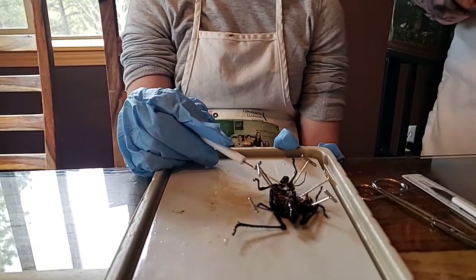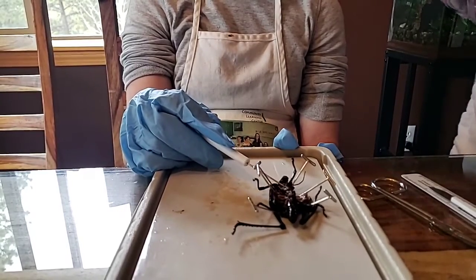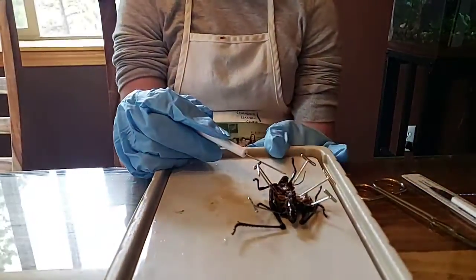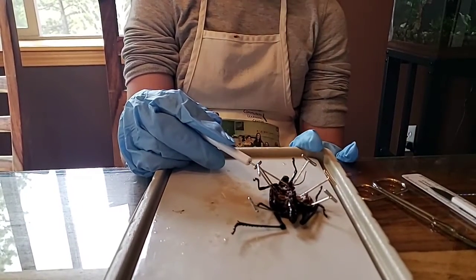That big round thing that you're looking at, see that bulbous thing, Tanley? The big round ball? Yep, that right there. So on your sheets, Lanston, can you open up your sheet so that you can label some of these things for sister? That big round bulbous thing is its crop.